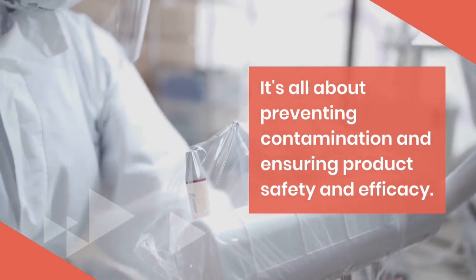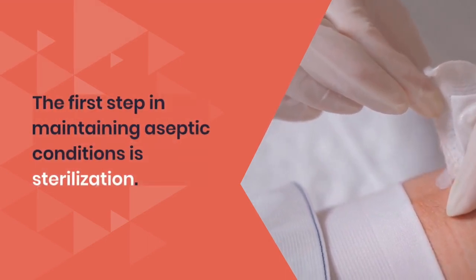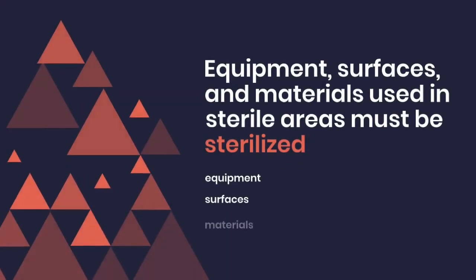1. Sterilization. The first step in maintaining aseptic conditions is to sterilize the equipment, surfaces, and materials used in the sterile area. Sterilization methods include autoclaving, steam under pressure, dry heat, filtration, and chemical sterilization.